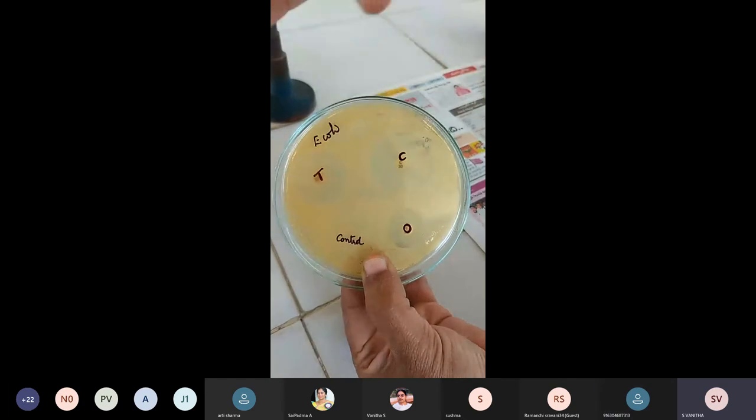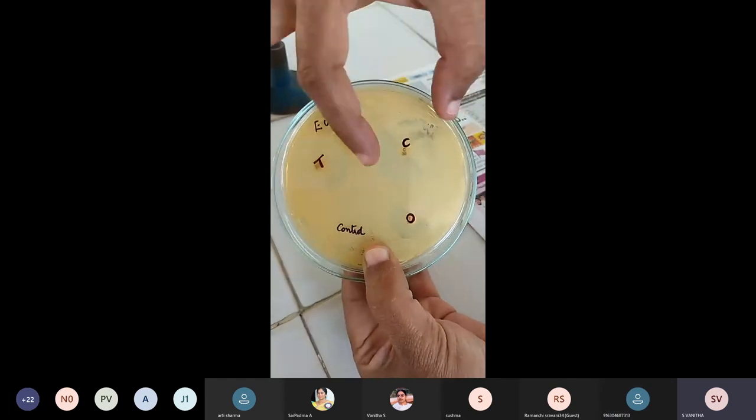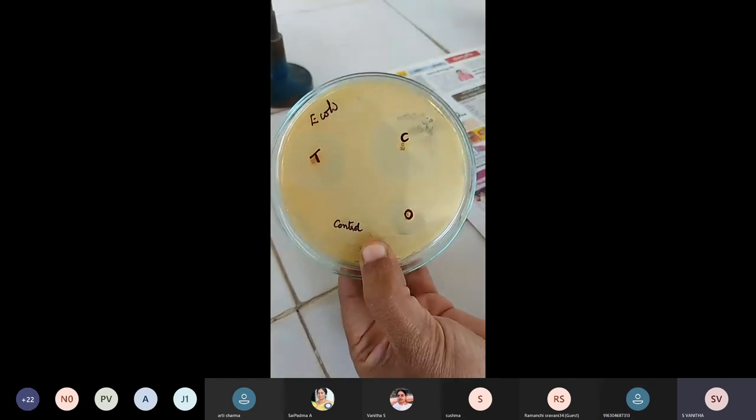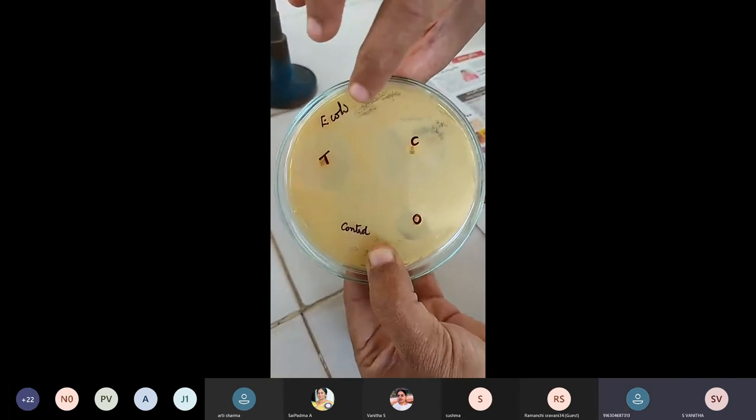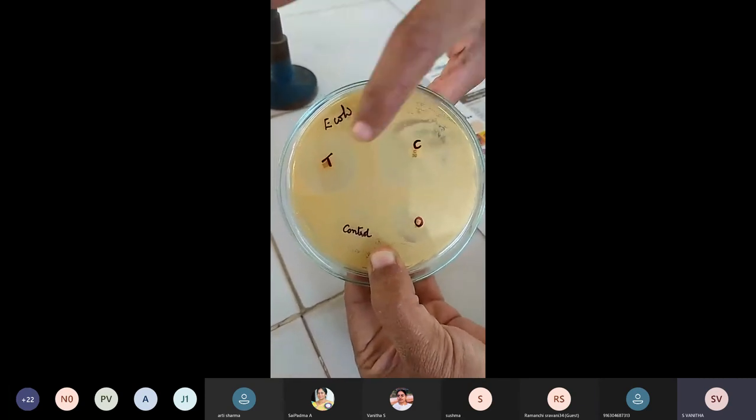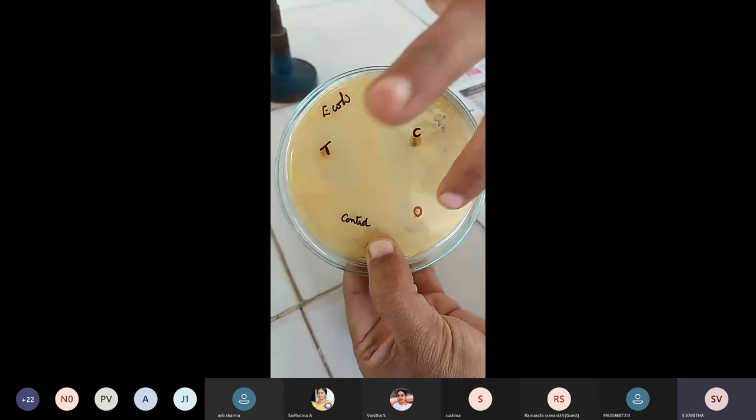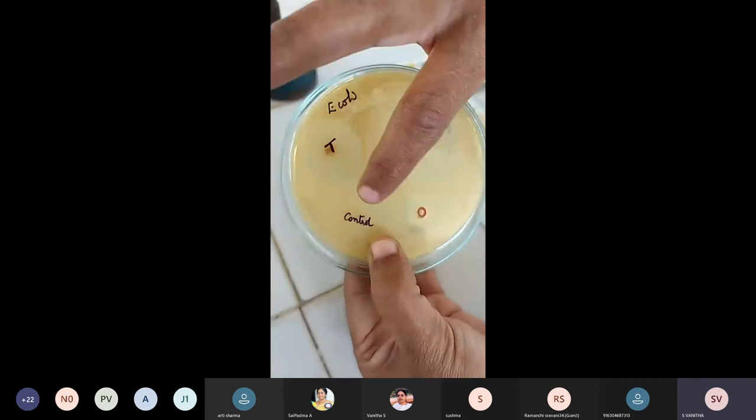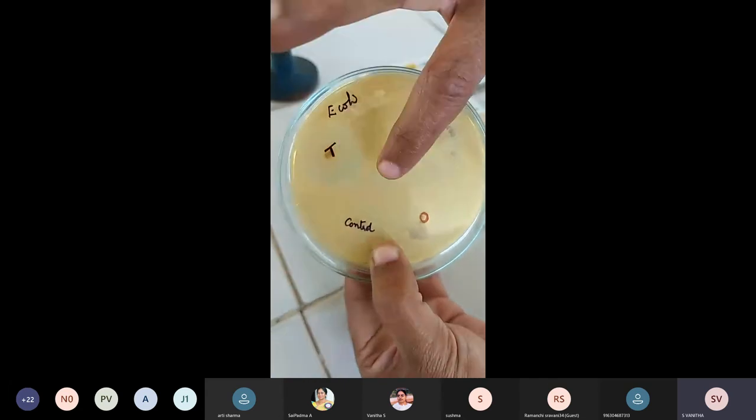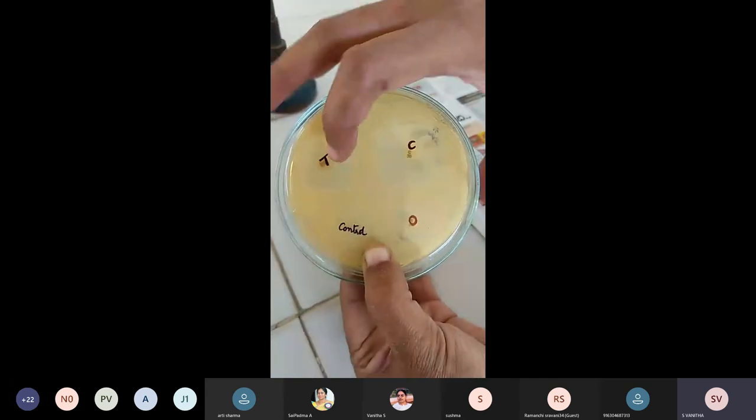So this is the diameter. Using a scale, you have to measure the diameter of the zone of inhibition. Remember, this is E. coli cells, and you can see the zone of inhibition for all three antibiotics. For the control where we have kept just the disc, you are not able to find any zone of inhibition.